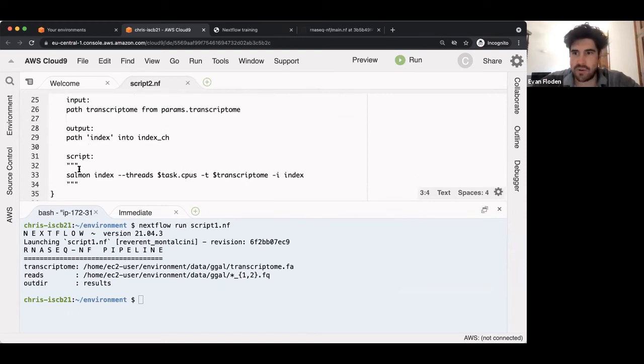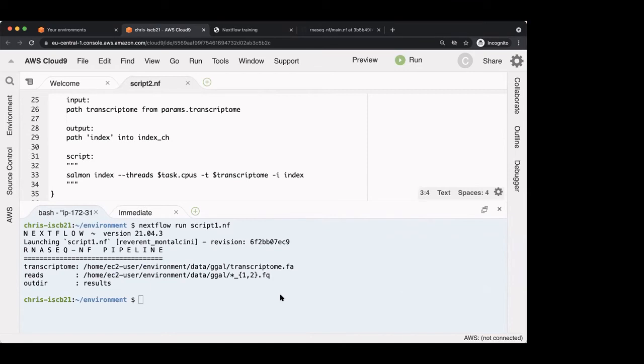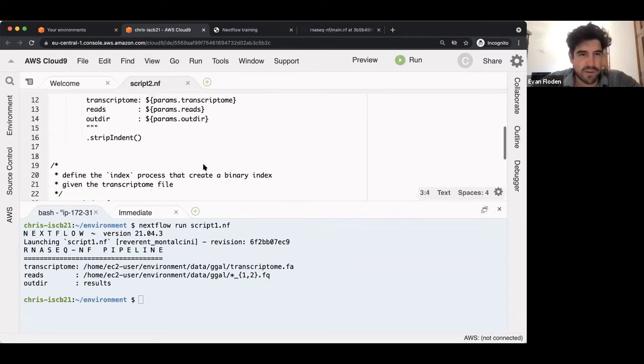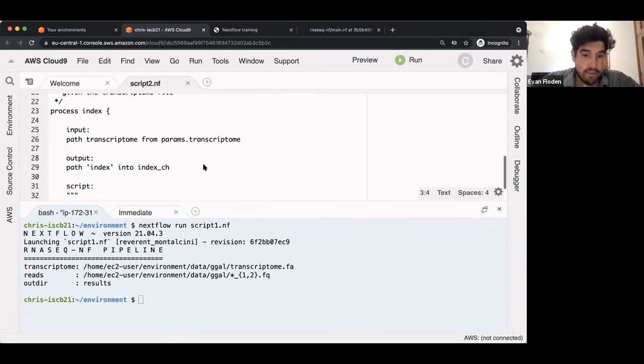Is there a question? Is it HK? Yeah, Evan, just a quick question. So is the base dir automatically defined, or is that defined at runtime? Yeah, the base dir is taken from the project base directory. So in most cases, it's going to be the same as where you run the pipeline when you're developing locally, but it makes a difference when you run.